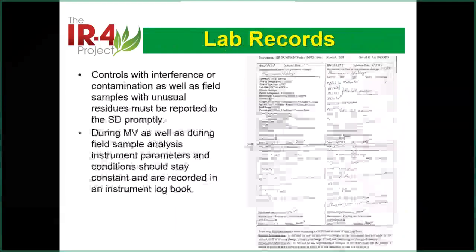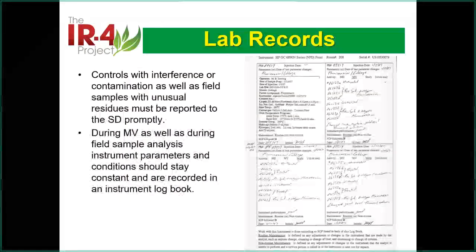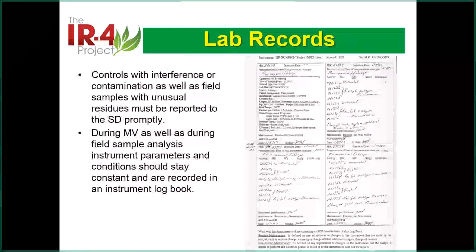Okay. The lab records could be any kind. I went to all the labs. Your record should be okay if you can catch all activities. I'm not going to go into the detail of how and why. I don't like this kind of record because it's too much writing. I like something like a form. You have a box there, you check the box. If you need to write something, it's just the date or some number. Okay, and this is 10 grams of sample. You write it down like that, rather than keep writing the wording.